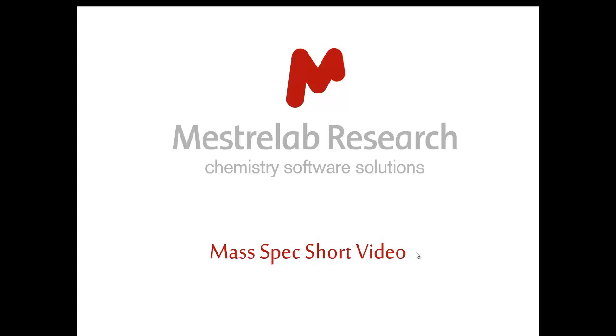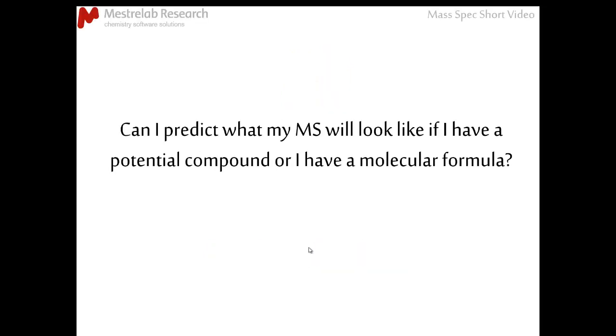After taking a look at my previous video on MS prediction, the next question is probably obvious. Can I predict what my MS will look like if I don't have a spectrum to compare it to, but I have my potential compound or I have a molecular formula?